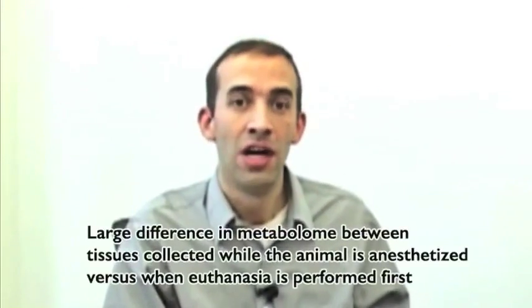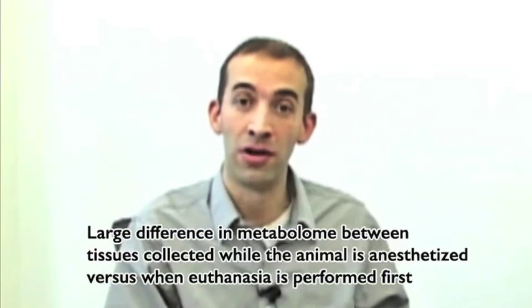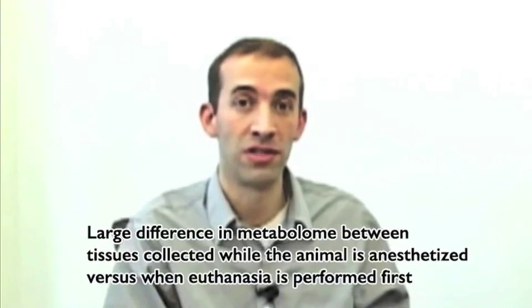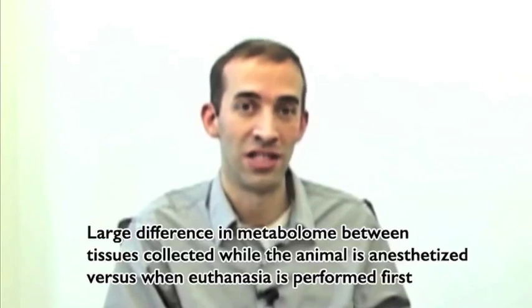So you mentioned anesthesia. What are some of the effects of anesthesia on the metabolome? Sure. So most procedures involving anesthesia ultimately involve sacrifice of the animal from which the tissues are being collected. But one thing that we've noticed is that there's a critical distinction between procedures where tissues are collected while the animal is under anesthesia but still breathing, compared to procedures in which tissues are collected after the animal has been euthanized, and tissue collection is then performed immediately thereafter.